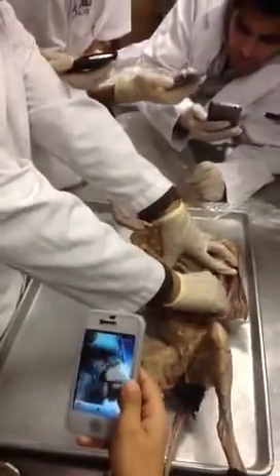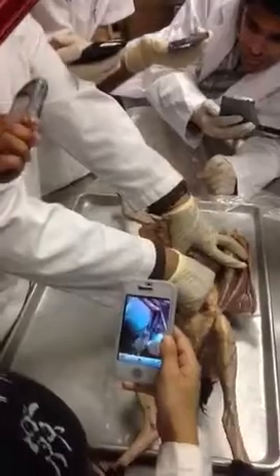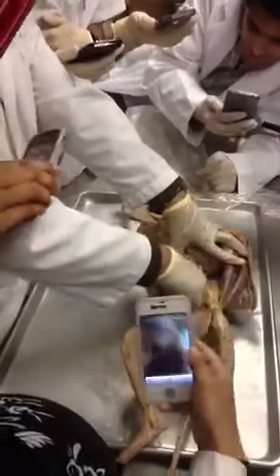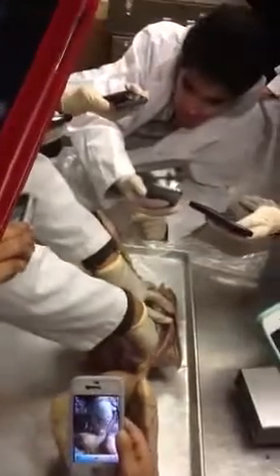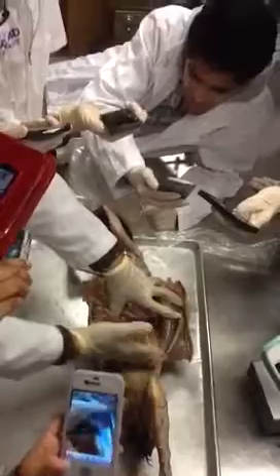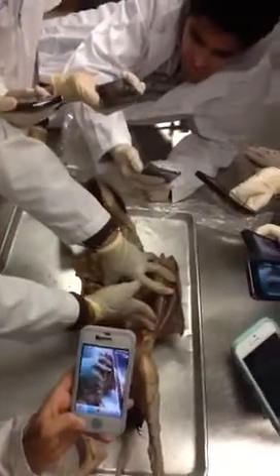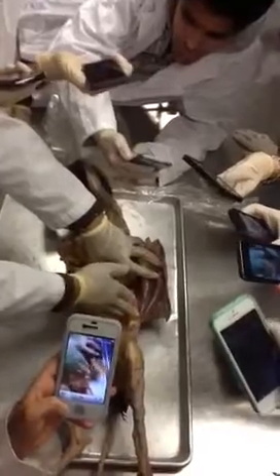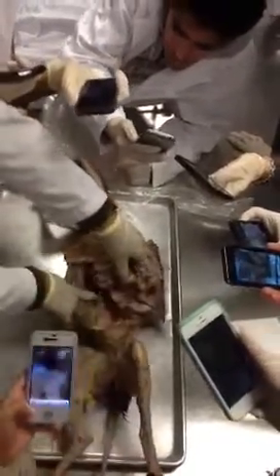Now. So this is the kidney. I asked you to give me some dissection kit, but unfortunately you don't, right? So this is the kidney, all right? You know that kidneys are called retroperitoneal because this is the peritoneal cavity, and you can see easily that the kidneys are at the back, right? So retroperitoneal. We've got one kidney here and another one right there.